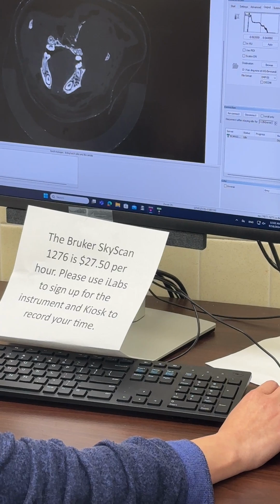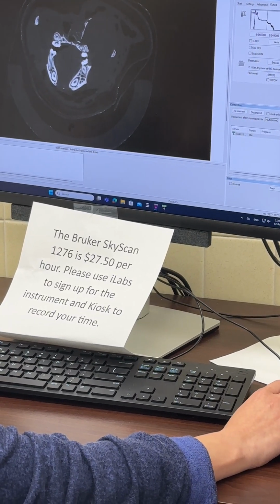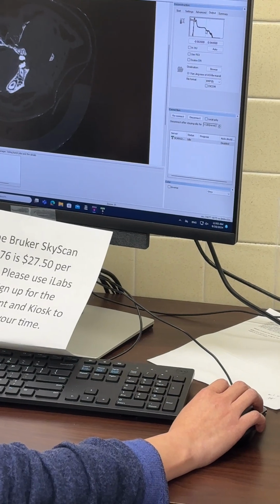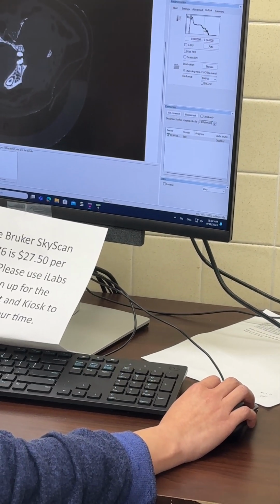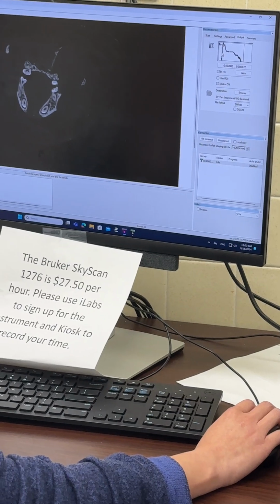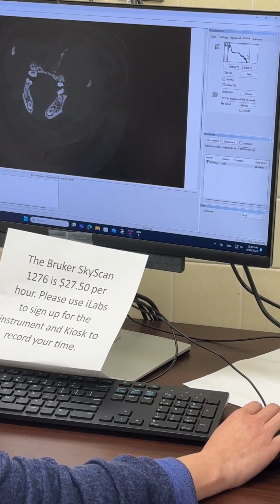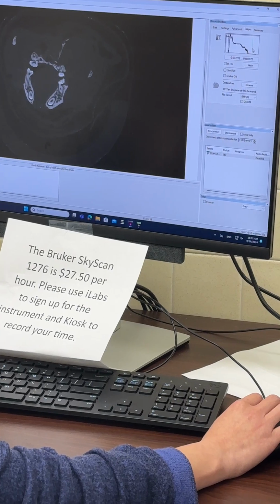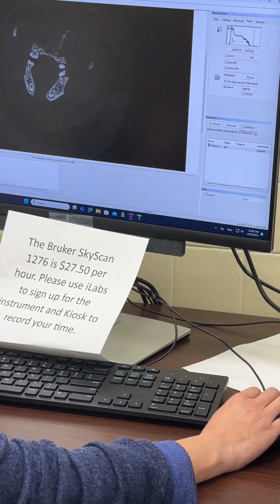Okay, so when the CT image comes out, it will automatically adjust and jump to the output. Here you can set the level, the number here, to make it brighter or less bright. Then you can see the signal better, the image better.